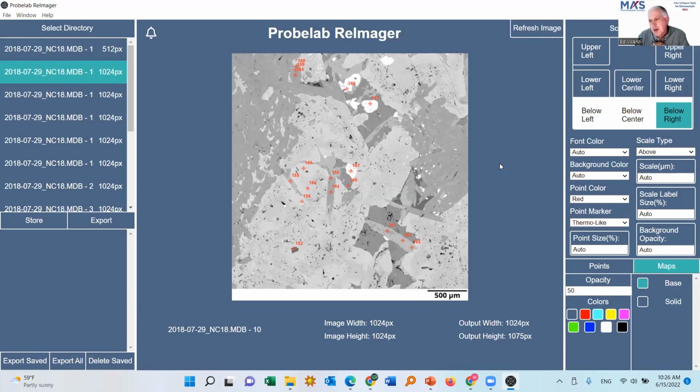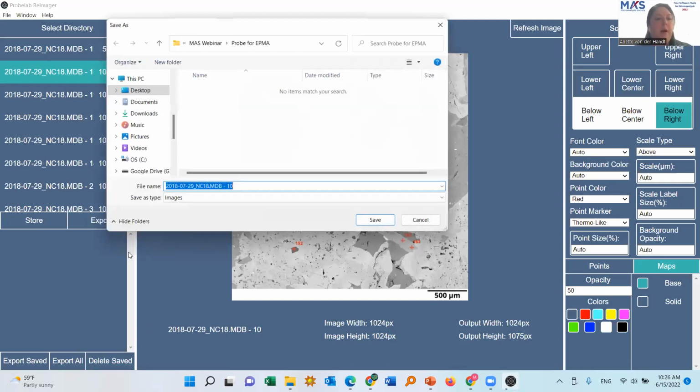Yeah. Okay. Well, thanks again. Okay. Well, let's see. We have a question about Reimager, just quickly, specific formats.